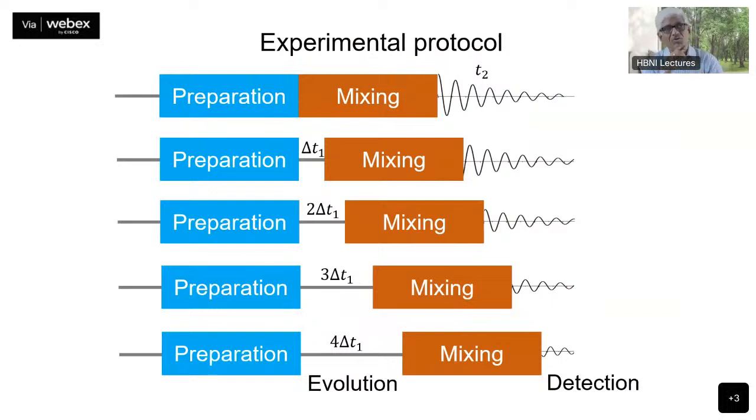This you can go on for, let us say, 256, 512, or 1024 time points. So you generate 1024 time points along the T1 axis. It is almost like generating another time variable. So you get 2 time variables. T2 is a time variable which contains the FID, collected in about, let us say, 2K points or 4K points. Usually in all of these, the FID contains 2K or 4K points. It is up to you.